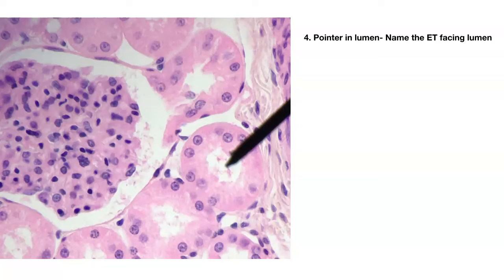Number four — easy. Look at those nice round nuclei, one layer thick. This is simple cuboidal.